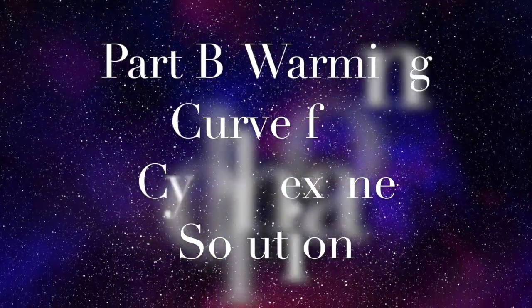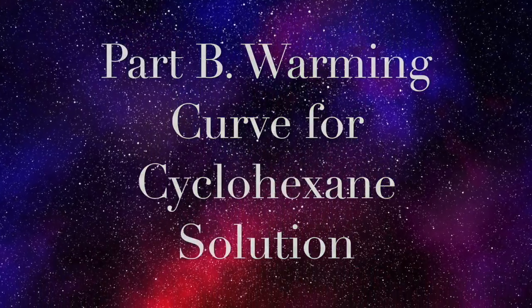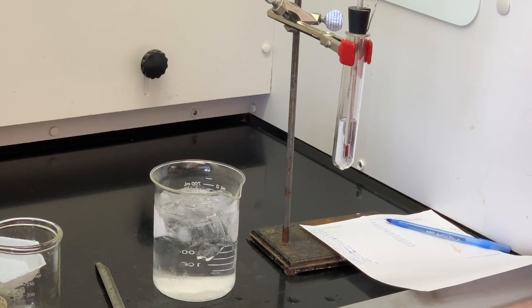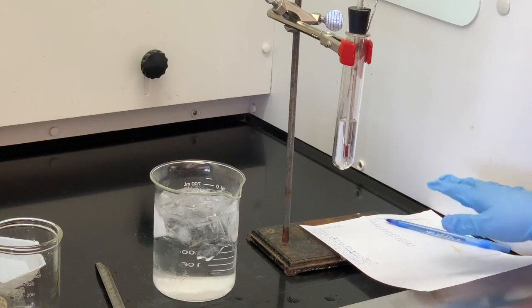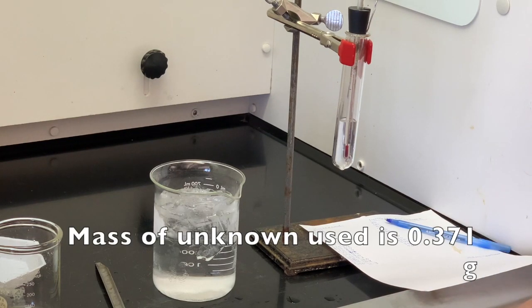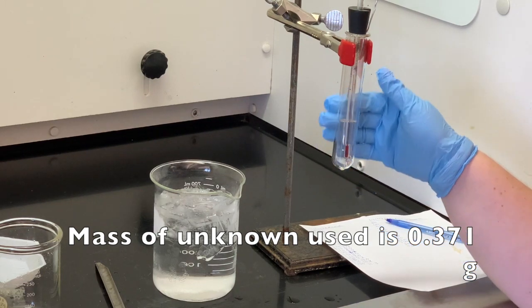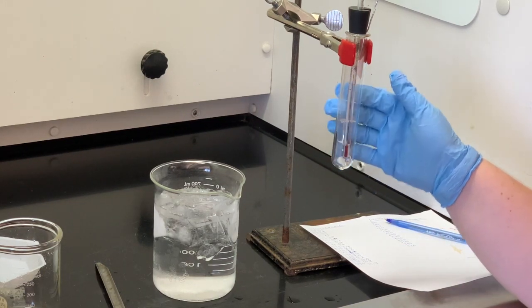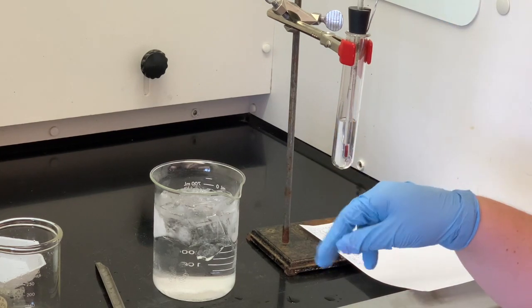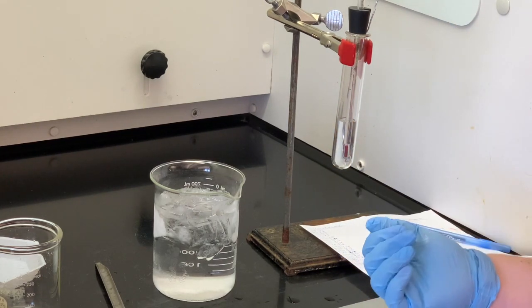Moving on to Part B, we're going to find the freezing point of a solution. We have an unknown that you are going to find the molar mass of — that's the purpose of Part B. We're going to add the mass of the unknown and then make sure it dissolves in our cyclohexane. I'm going to use the same cyclohexane and then put it in the ice bath, let that freeze, and do the same process.